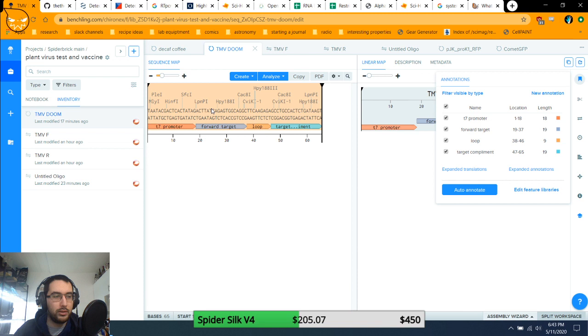It would grab onto here and just crank out millions and millions of copies of this in RNA, which is exactly what we want in order to spray it on my plants. One problem. I need the letters.